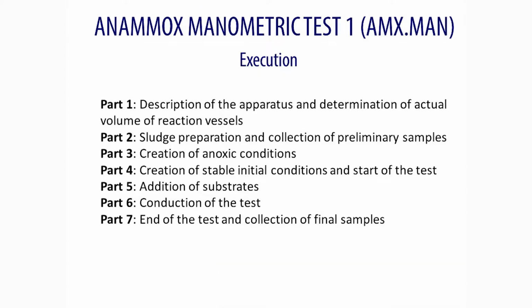In the following video, the main steps for the execution of the manometric test to assess the Anammox activity will be explained. It includes the description of the apparatus, sludge preparation, preliminary activities, as well as the conduction of the manometric test, and the activities that need to be performed once the test has been completed.